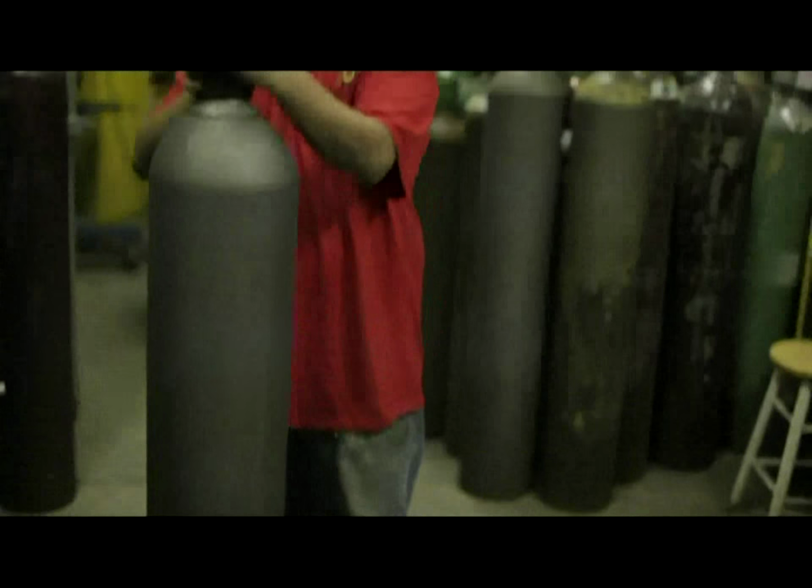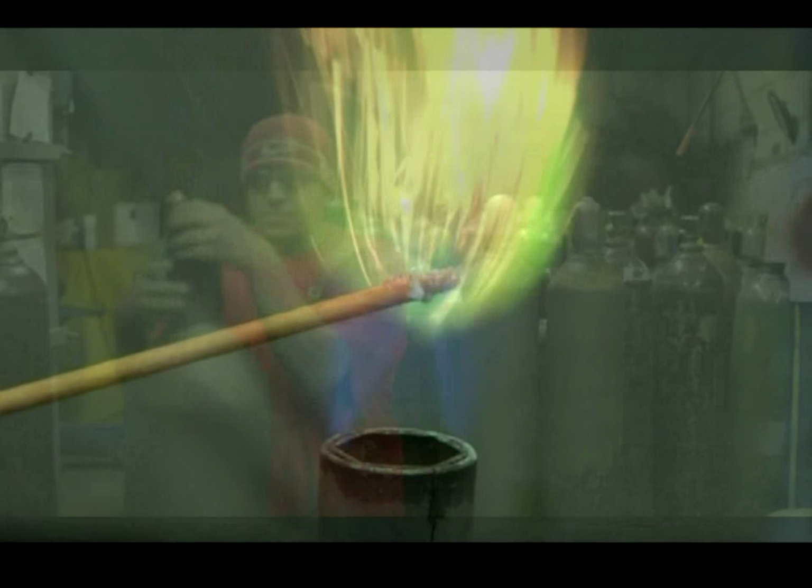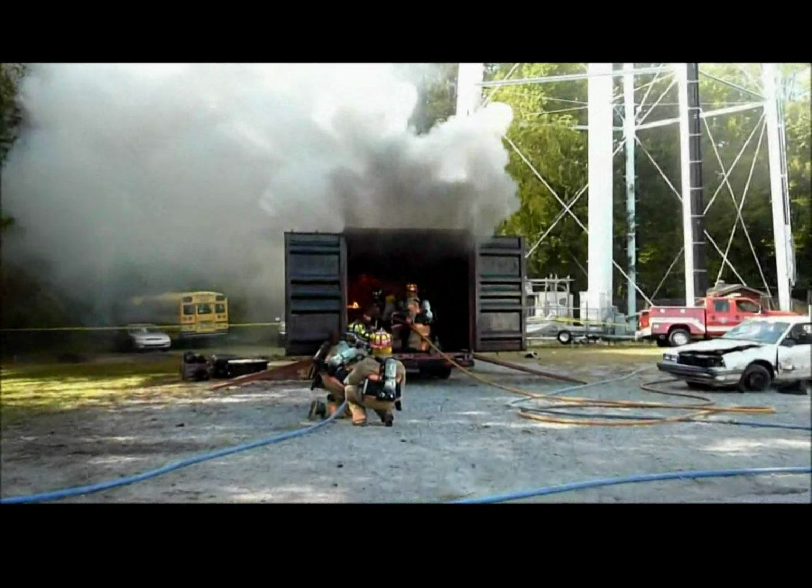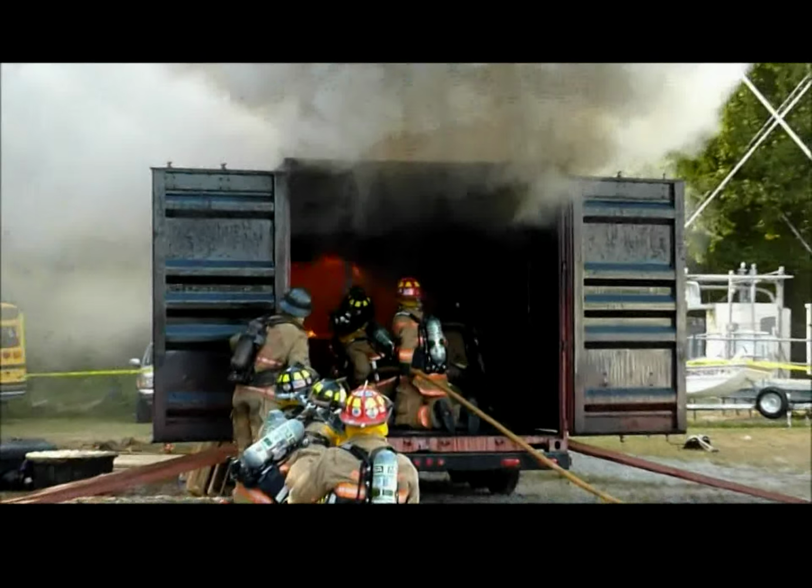Do not drop them. Keep cylinders away from direct heat such as furnaces or open flames. Store cylinders in areas designated by your supervisor. Have a look at this symbol. This means that the material is one that burns easily and is a potential fire hazard.